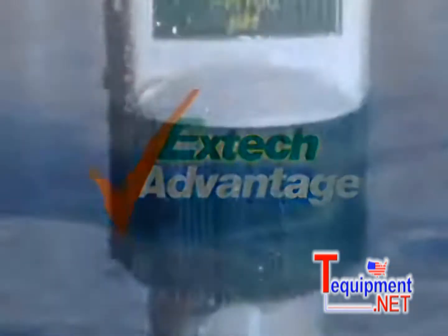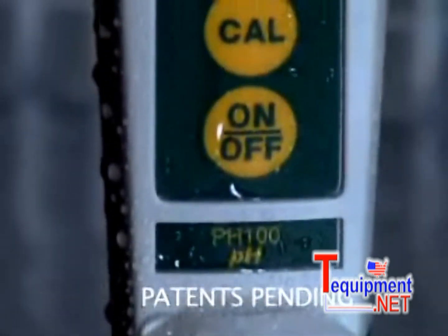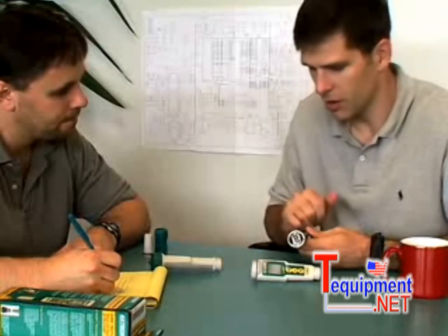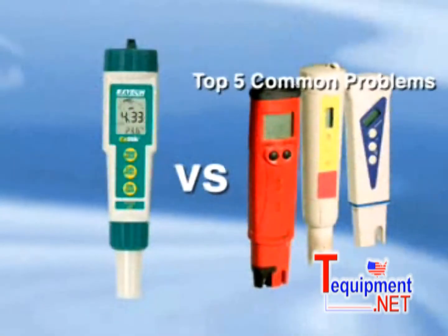Introducing the waterproof EXTIC pH meters, designed with innovation in mind. EXTEC design engineers have developed the EXTIC pH meters to offer solutions to the typical problems you face while using an ordinary pH tester. We will offer solutions to solve the top five problems a pH tester frequently faces.